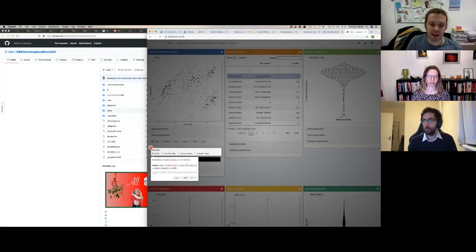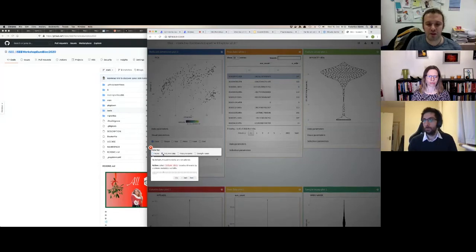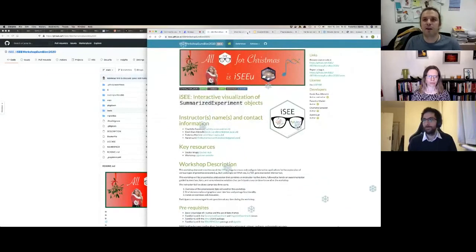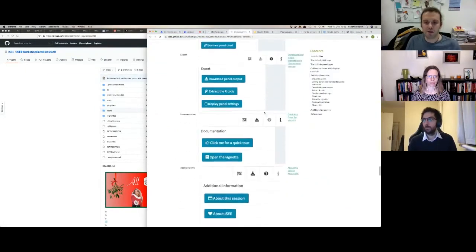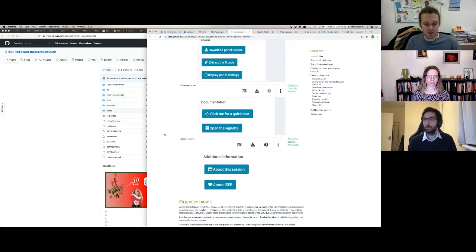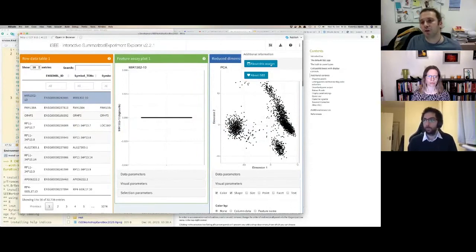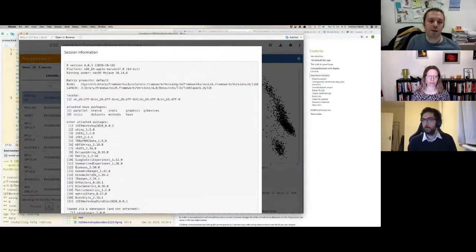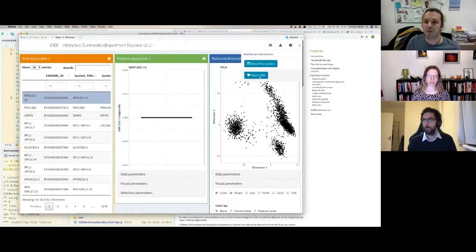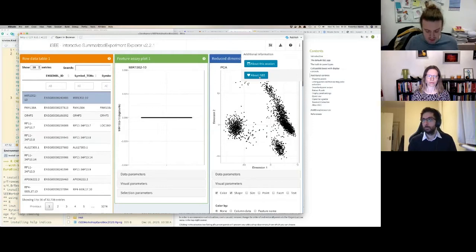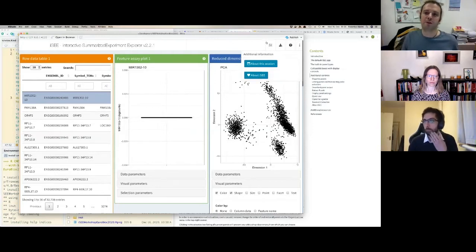During the tour, if the action tells you to click on a header, please do that so the anchor is placed in the right position. There are also additional controls including Session Info, which is useful for reporting bugs, and general information about iSEE.